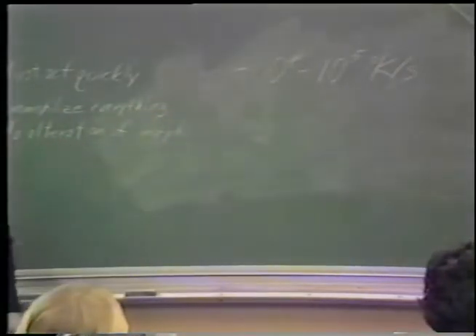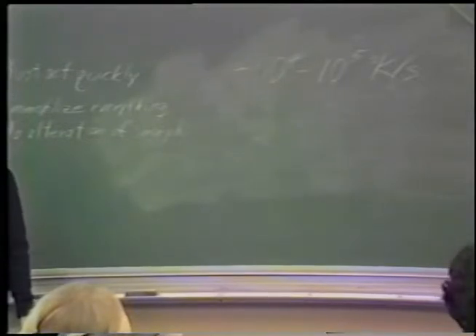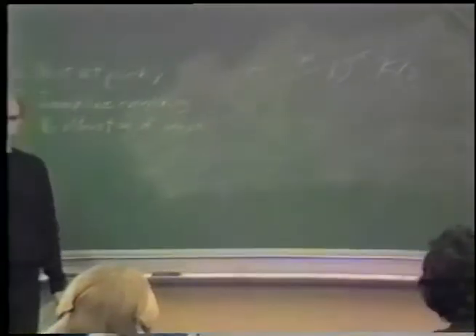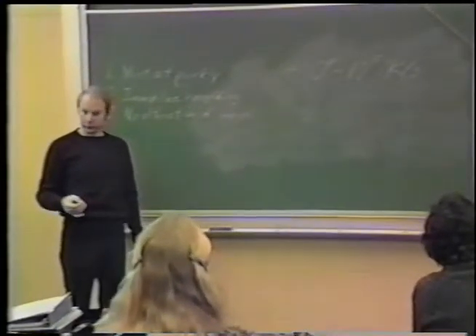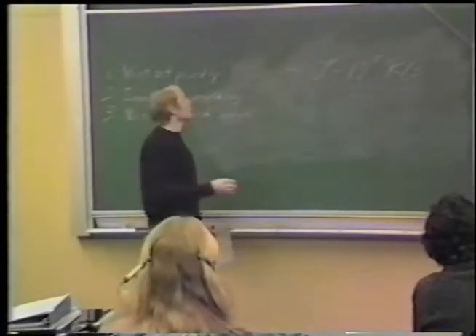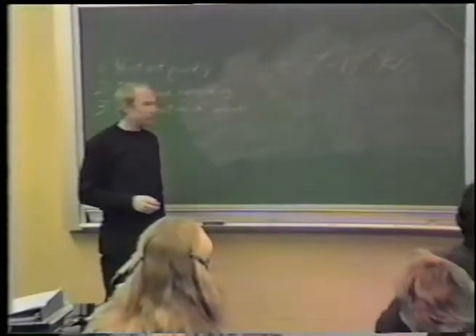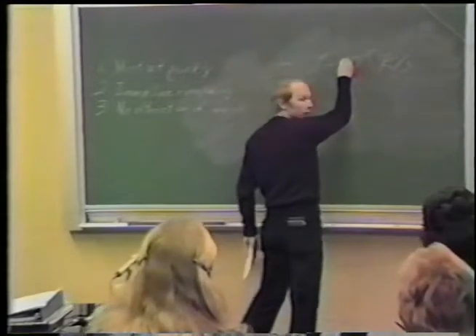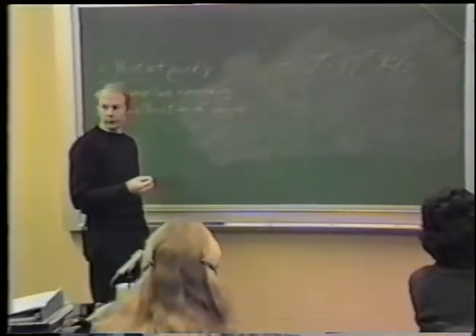And in those relatively reliable observations that have been made in systems where freezing has been done, the quality of freezing has been observed, and the rate of cooling was measured. It's really hard to do that. This has been confirmed. The rate of cooling does seem to have to be within this range in order to get ice crystals as small as they have to be for successful ultra-rapid freezing.